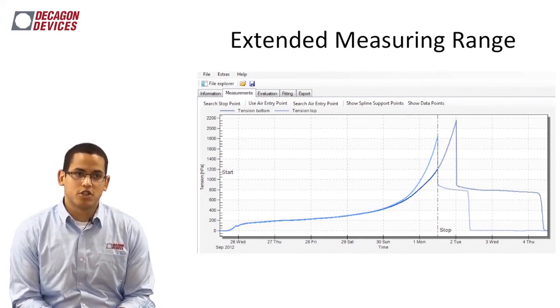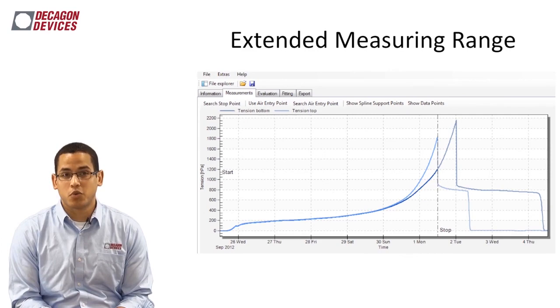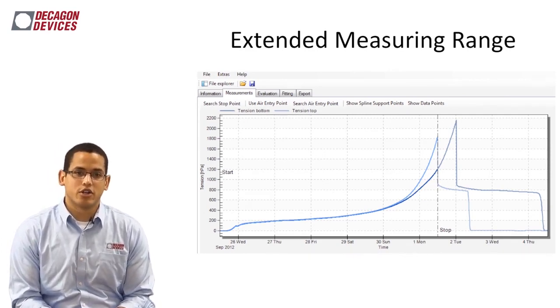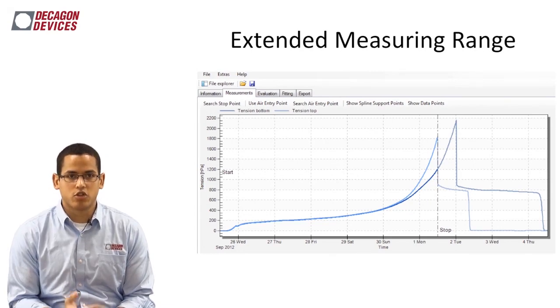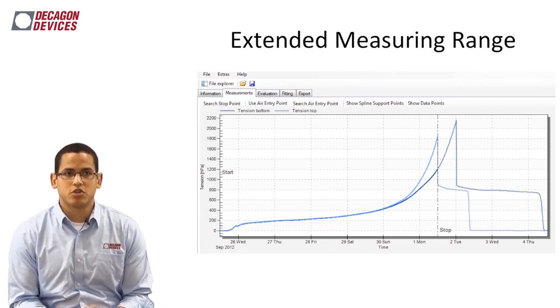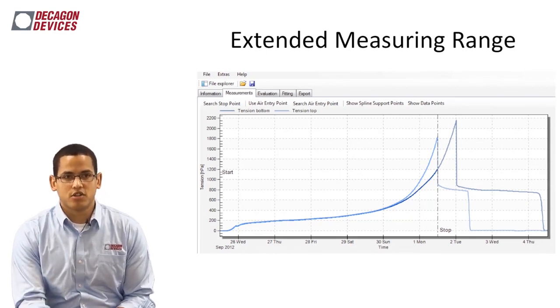And we were able to push the bottom tensiometer all the way up to almost 2200 hectopascals, so almost 220 kilopascals, which is a great area to reach, or something you want to try and reach with these HyProps. It is possible to push them into this range and beyond that.